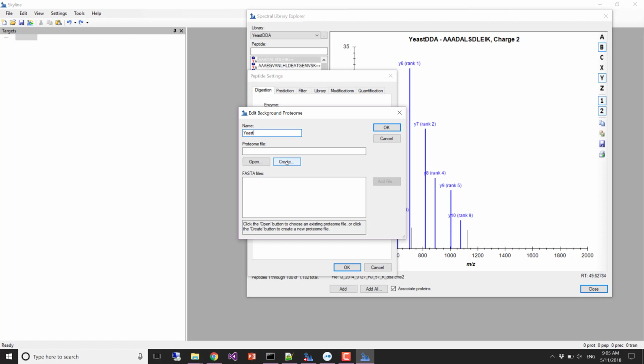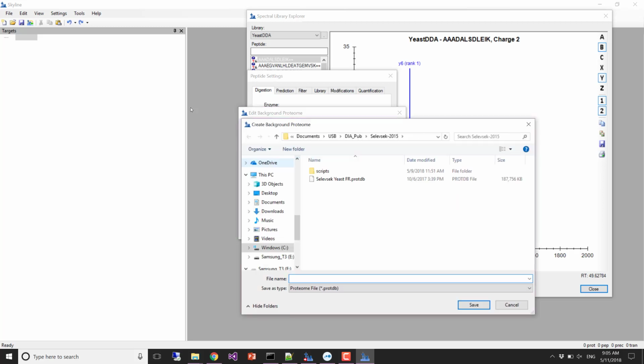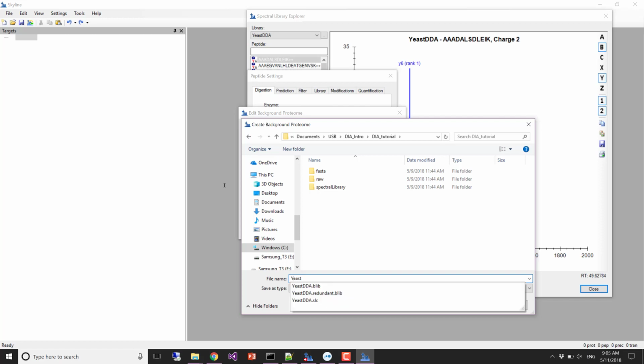People following that? Those who are interested in it. And then we're going to go to USB intro DIA tutorial, and we'll save it here, and we'll just call it yeast, and save.